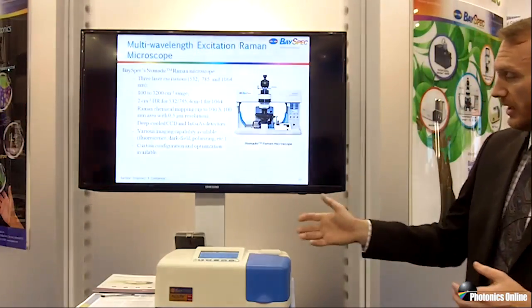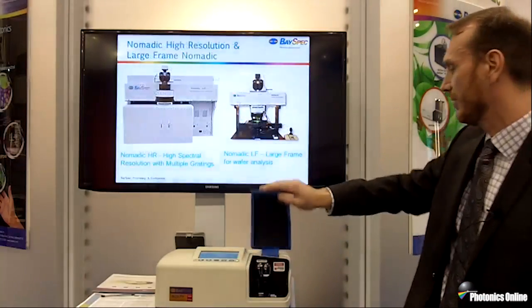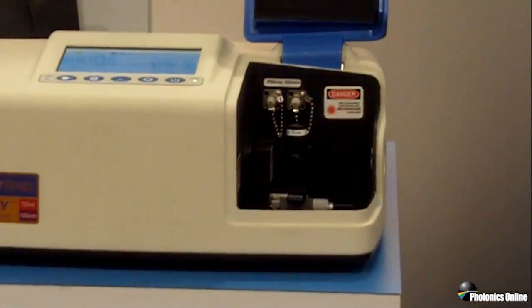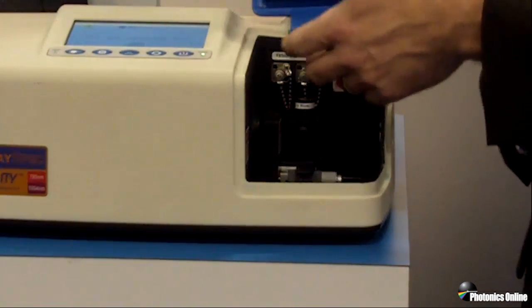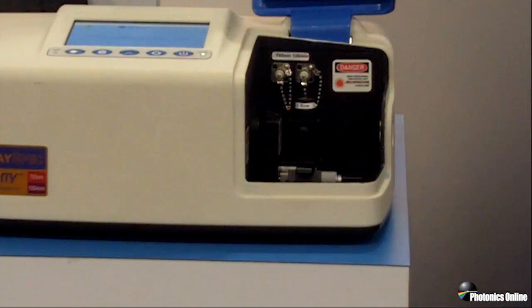The Agility has many different options with regards to sampling. We have our sample chamber here — this is where you introduce your sample. In this case, as I mentioned, we've got the Meyers rum in there. You can do liquids, you can do solids, you can do pills with different sampling components, and also you can direct couple a fiber dip probe or a trigger probe if you want to look at samples at a distance.